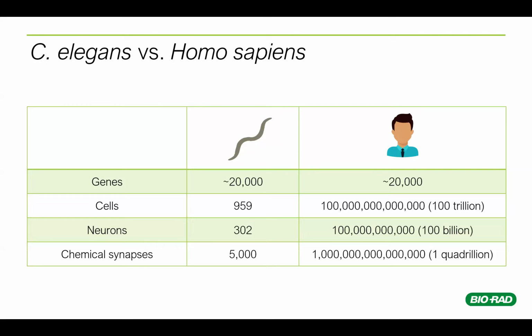And if you can maintain that train of thought, can other types of E. coli be used? Yes. We use OP50 because of the way that they grow. They're one of the preferred E. coli to use for C. elegans because they don't create as thick of colonies, so it's easier to see the worms in them. So that's half the reason to use the OP50s instead of, say, HB101 or something like that.